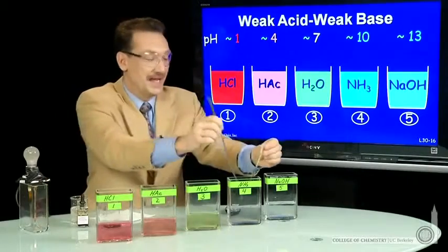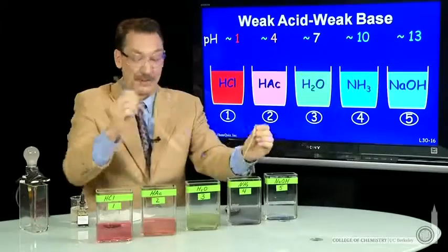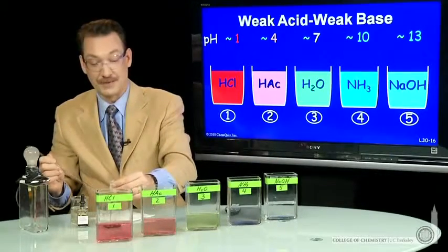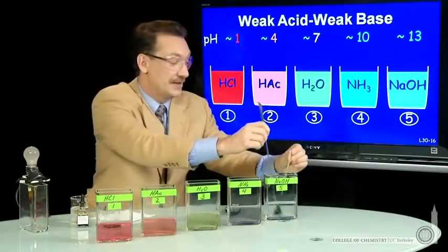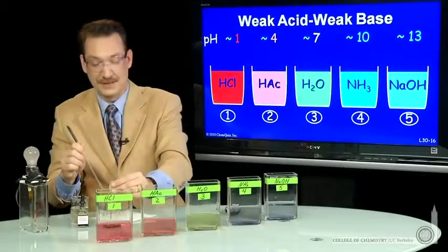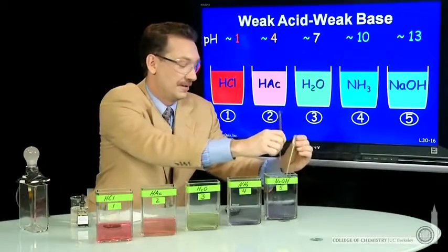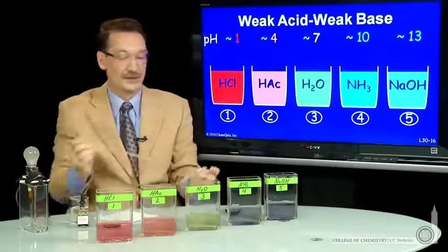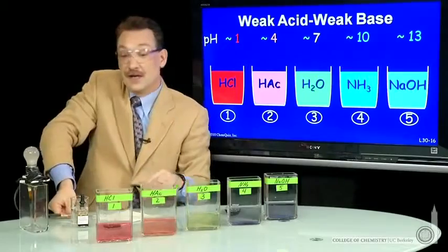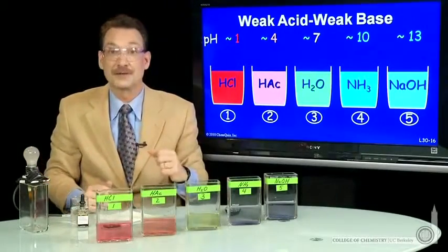So the base turns this indicator blue. That's a nice little mnemonic to remember because the bases are blue, both starting with the same letter. And here's sodium hydroxide, the stronger base solution. So that's indicator in the strong acid, weak acid, water, weak base, and strong base solution.